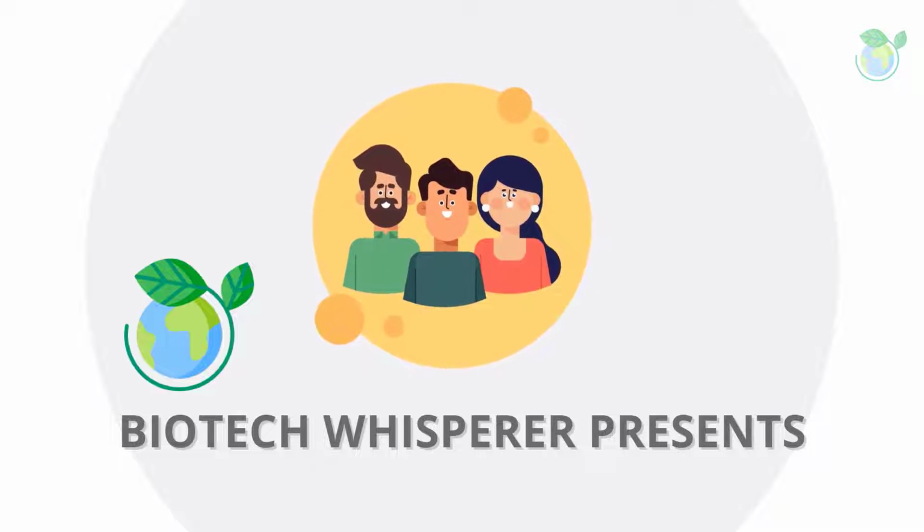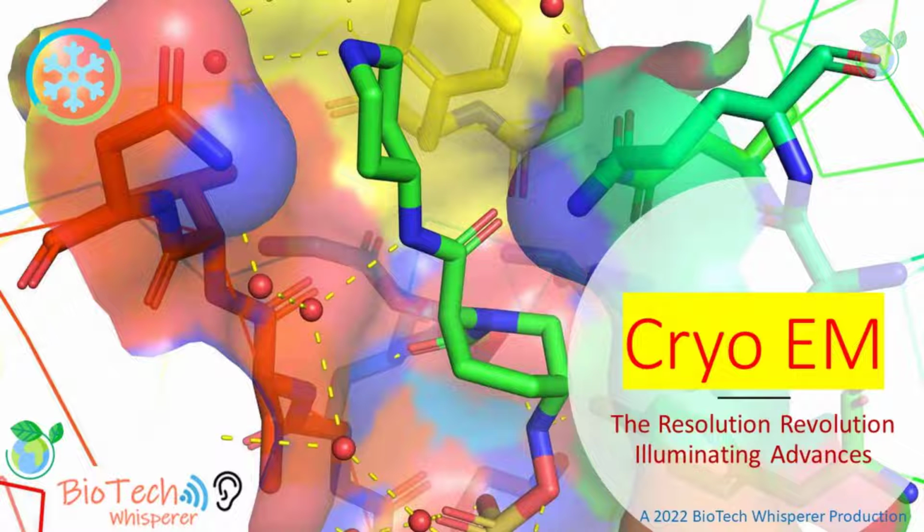Our topic today is on the resolution revolution, illuminating cryo-EM studies.